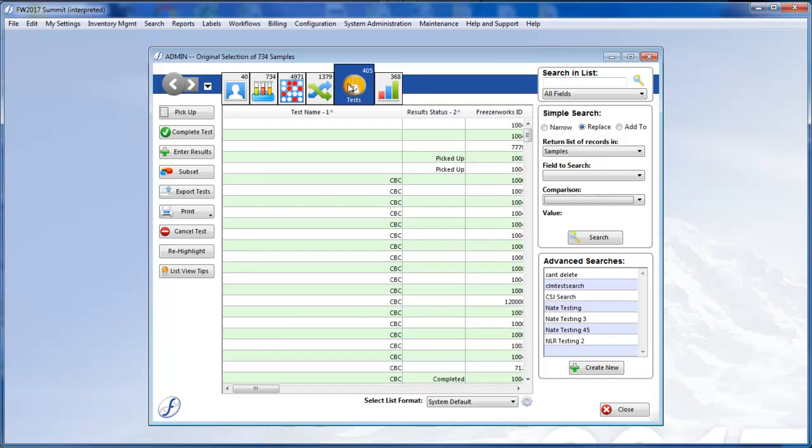You can now view and work with both inventory and testing data from the same location. In fact, most, if not all, testing tasks will be performed from the Inventory List View now.